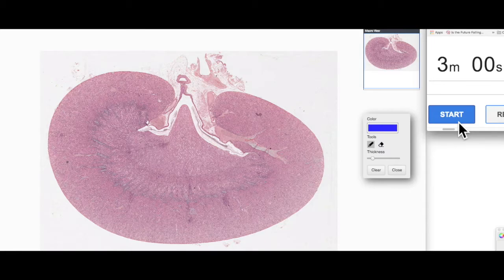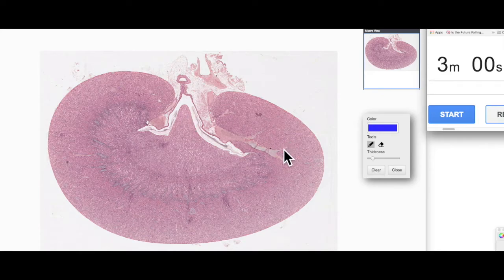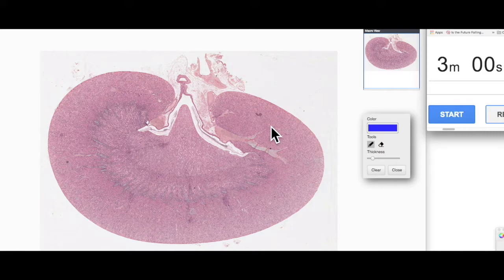Hi and welcome to 3 Minute Histology with Jamie Chapman. Today we're going to be looking at an overview of the histology of the kidney. We're not going to be zooming in, we're just going to be looking at the major features at this magnification, putting into context the anatomy of the kidney with the histology. I'll be pointing out the major features in three minutes. Let's start our timer.